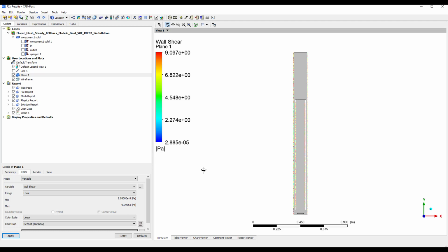Then, from this model and from this methodology I am presenting to you, of course, a basic tutorial or video, you can begin to try to model your own bioreactors and detect which is the model that best fits your requirements and obtain a very good model which can help you to do virtual prototyping and scale-up processes.